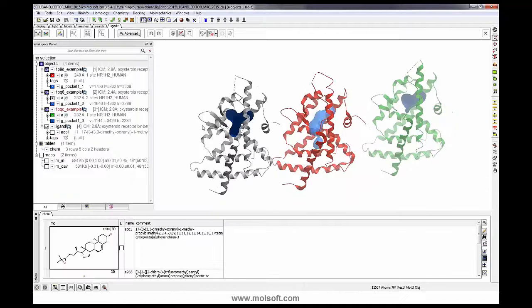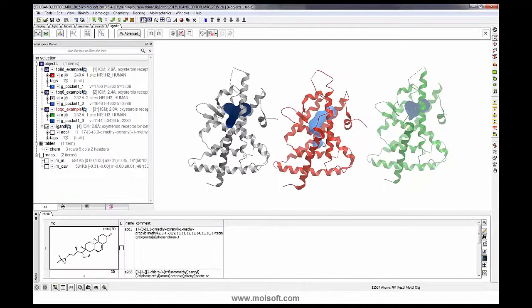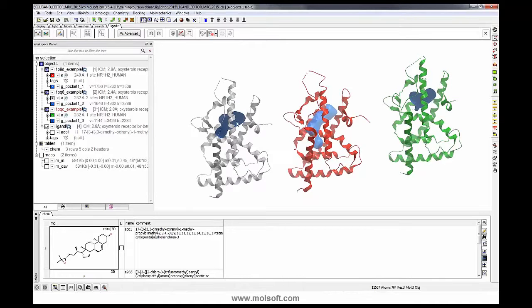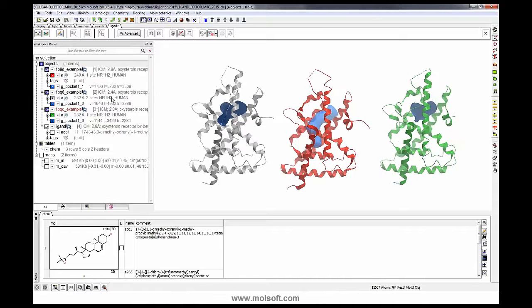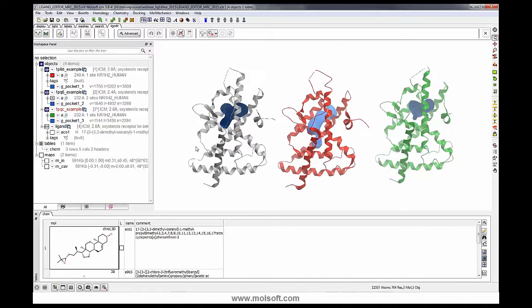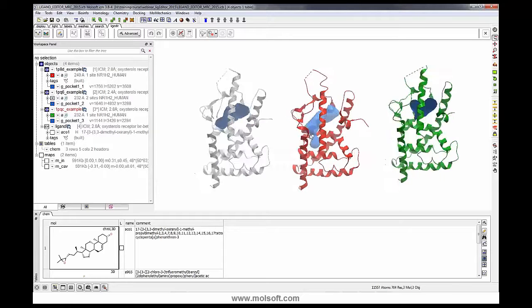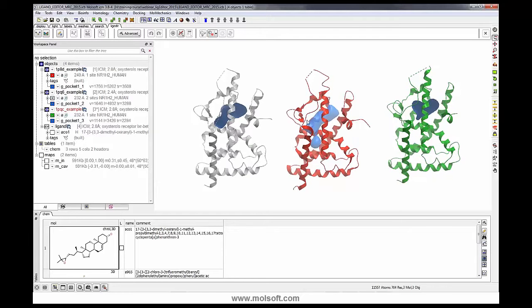And these are the same proteins, but the pocket differs quite significantly. So we have 3 similar structures from the same nuclear receptor family, same protein actually, but depending on the ligand and the pocket state, the pockets change quite dramatically. I used the ICM pocket finder to show the pocket.